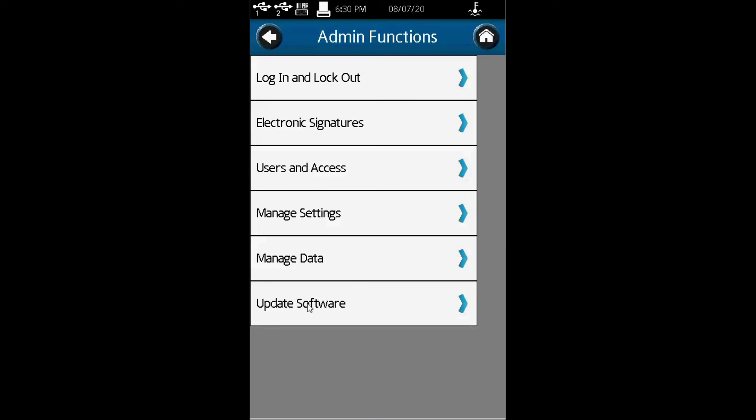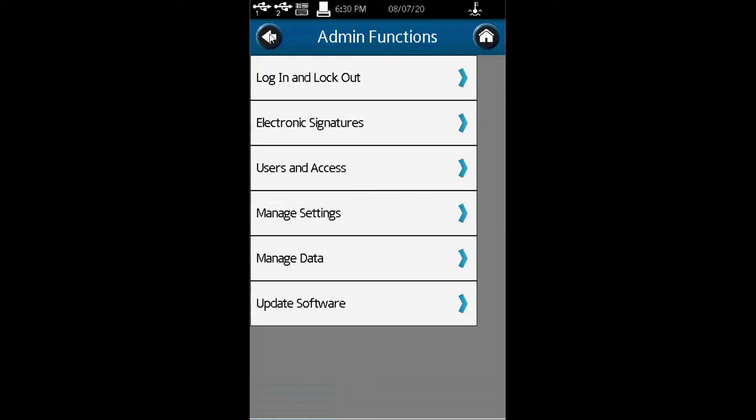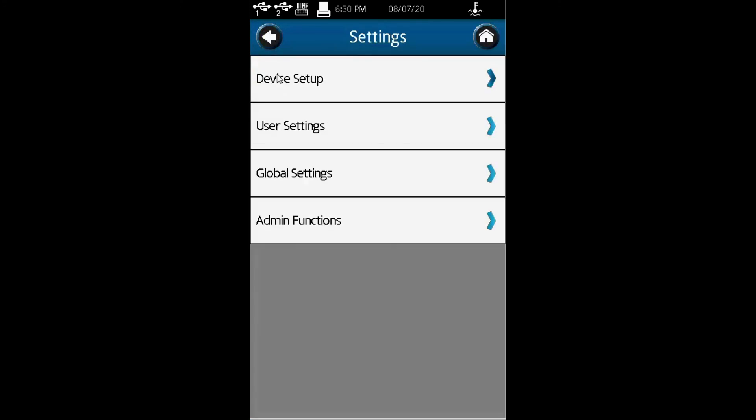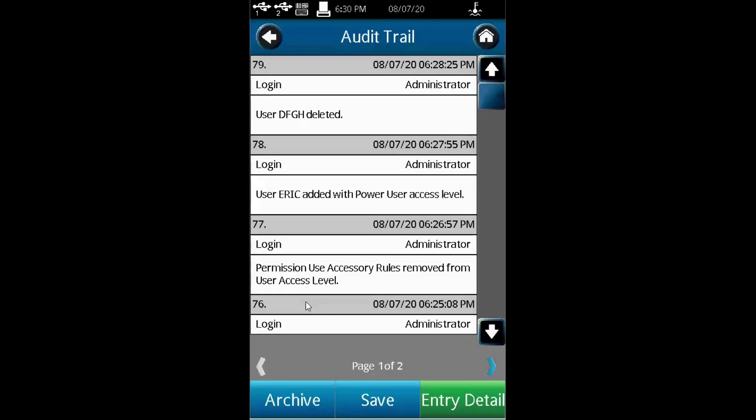You can also do software updates to the firmware. Under device setup, you also have an audit trail. You may ask, how do I know what information is saved? Under audit trail in device setup, you just click audit trail.